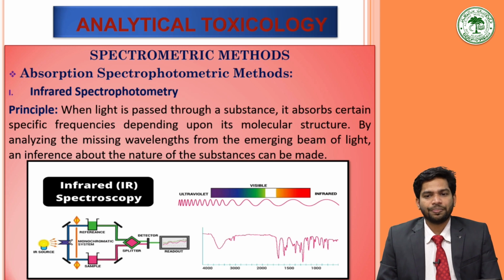Once the sample is prepared, a beam of infrared light is passed through the prepared sample. From the emerging light, an absorbance spectrum is produced. It shows the infrared wavelengths which the sample absorbed. Analysis of these absorption characteristics reveals details about the molecular structure of the sample.